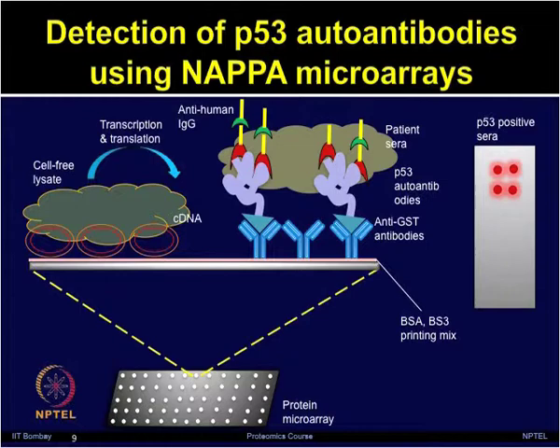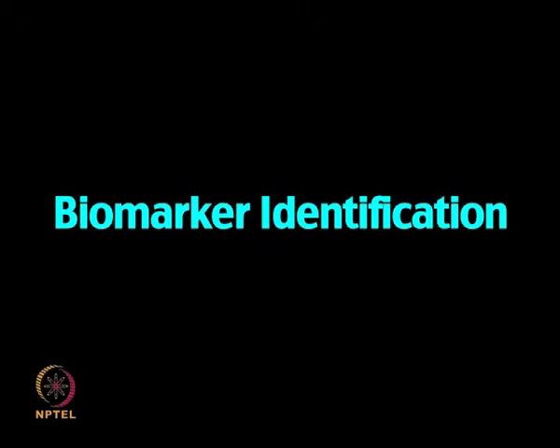Let us discuss the details of the study in this animation. Biomarker identification. In this animation, we will discuss detection of P53 autoantibodies in human serum using cell-free expression based NAPA microarrays. Study by Anderson et al. 2008.